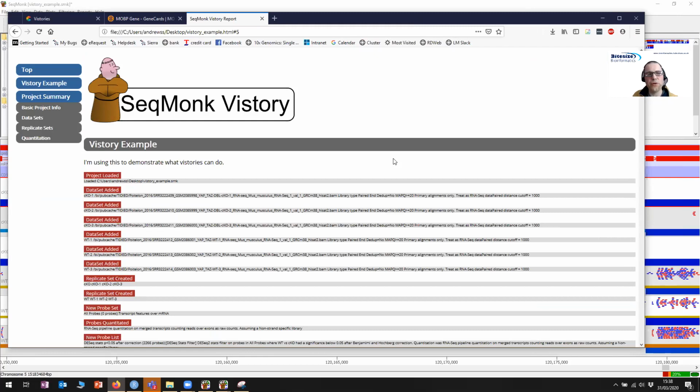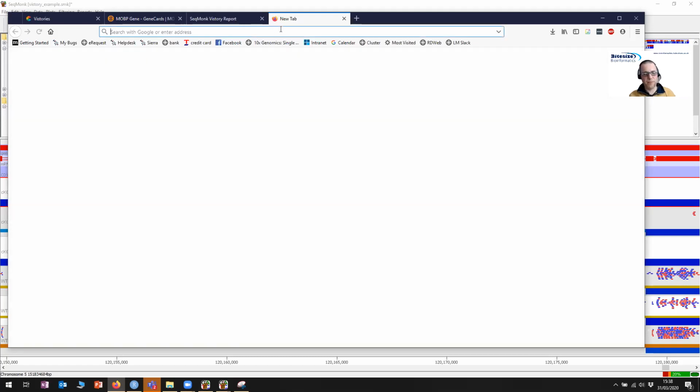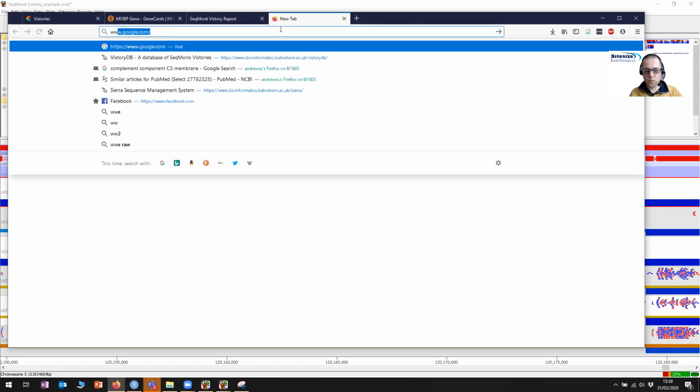The final thing I want to show you is something that we've built on top of this. Because these Vistories are a really easy way to quickly demonstrate how to do something in SeqMonk, we always want to put out more examples of how to analyze particular types of data. We've got some videos up on our YouTube channel, but videos are quite laborious to do, and they need redoing every now and again. So a new thing that we've put together is on our website.